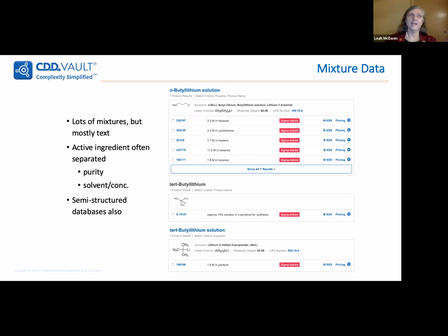Point on that, yeah. On the flip side, as artificial intelligence and machine learning is becoming more incorporated into research design, the more you can incorporate standard machine accessible ways of describing your process, the more you can play with the parameters, you might say. And the way that MInChI is structured, it can play quite nicely with InChI and with other formats. You can easily parse apart the information and plug it around. So there's a lot of opportunity.